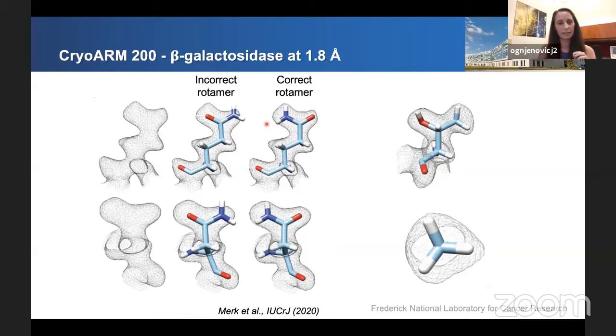And there were even several NQH side chains where the orientation actually differed between the 1.6 and 1.7 angstrom X-ray structures, demonstrating that the ambiguity persists even into the high resolution range of X-ray structures, and that although our BetaGal map is nominally lower resolution, in some ways it contained a bit more structural information and ultimately led to a better model.